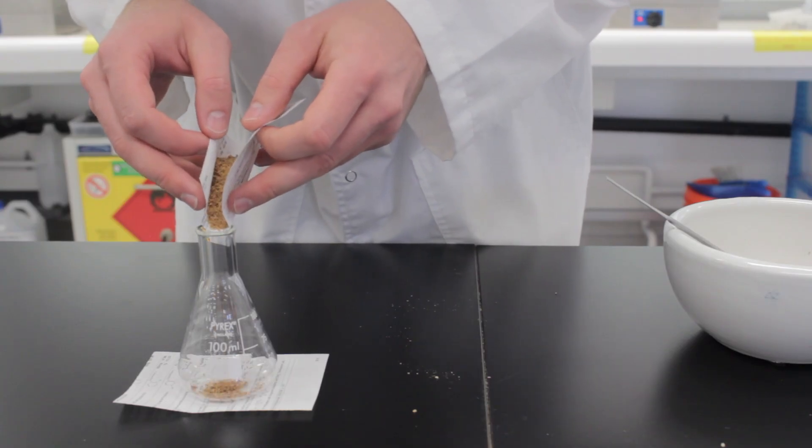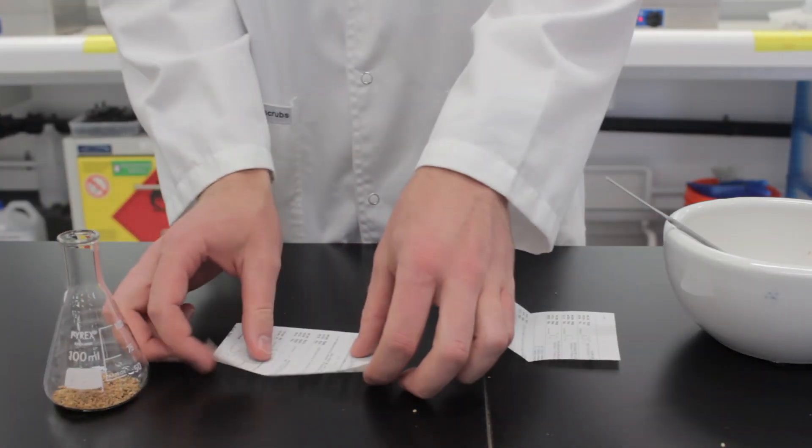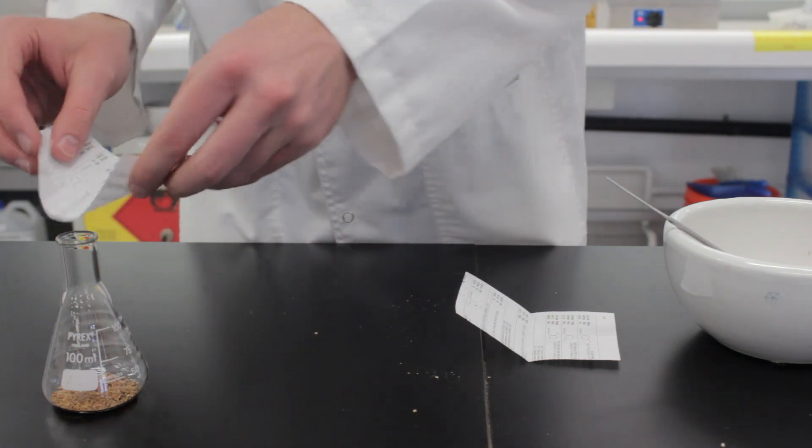Hot tip, put another weighing paper under your flask to catch any fallout and then use that to funnel it back in.